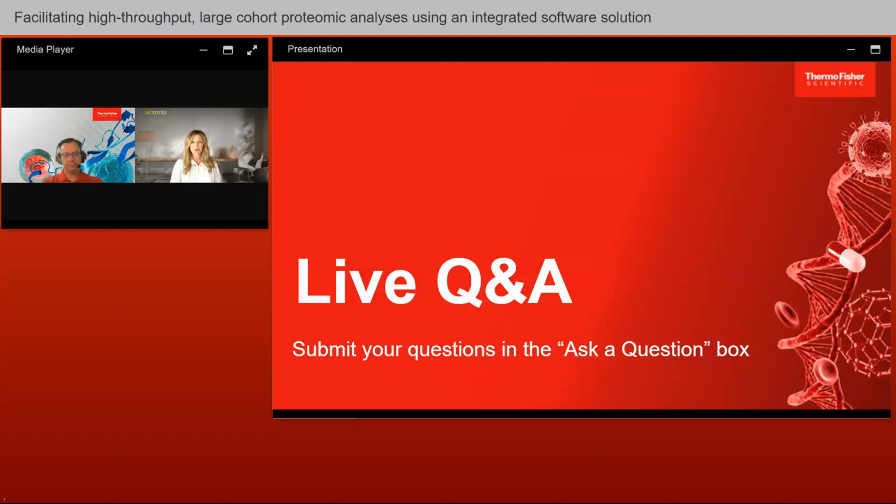Thank you, David. And another question that's coming in multiple times: when will PD 3.2 be released? Yeah, so PD 3.2, we're feature complete. It's in final testing now, so it's soon. I think it's tentative to give a hard date that's going to be out for sure, but tentatively in mid-November is when we expect the Proteome Discoverer 3.2 release to be available to all of you.